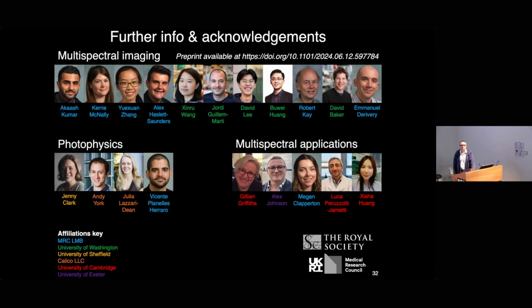Yep, thank you. Hey, really nice talk. You showed initially that you could do 8 colours and had a fairly good condition number in the matrix. What do you think the maximum number of colours would ever be that you would be able to get?